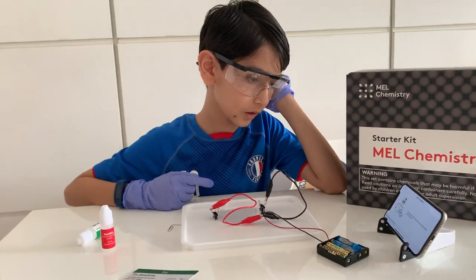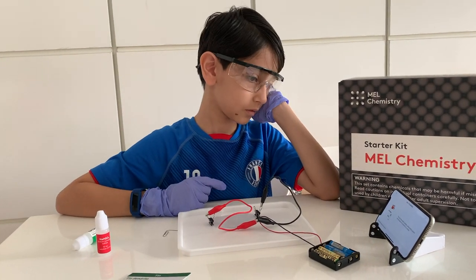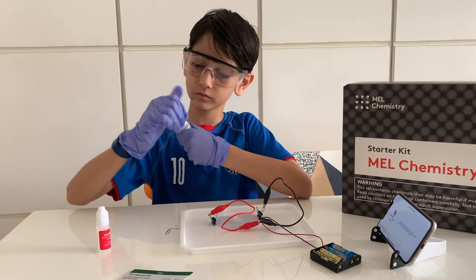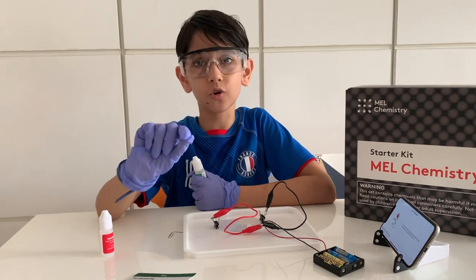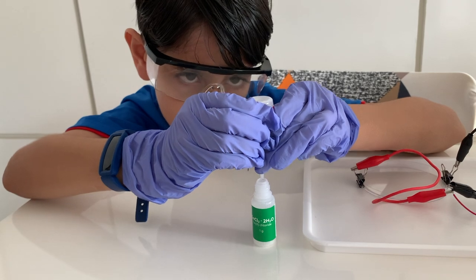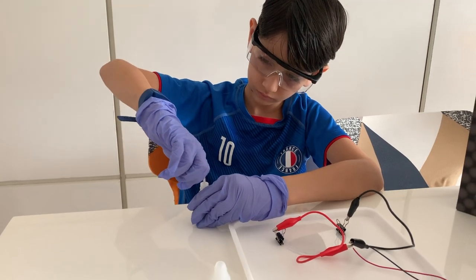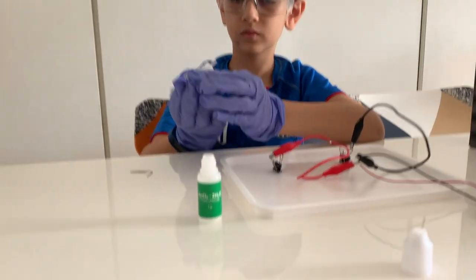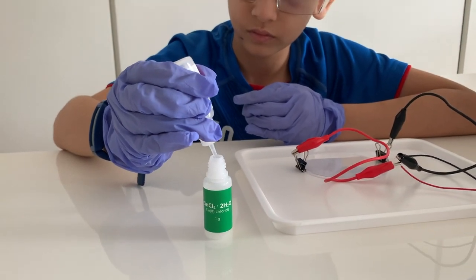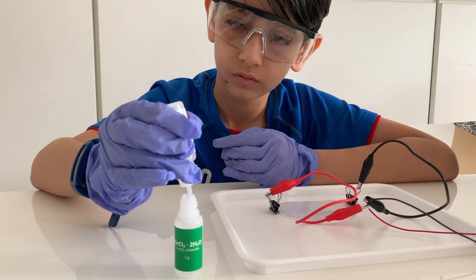What are we supposed to do next? Double check. Then pour out the sodium hydrogen sulphate. We have to mix sodium hydrogen sulphate and then add it to the tin chloride — we have to pour the whole solution.